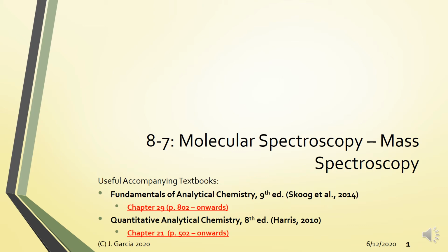So this is the last module for part 8. For this module, we will be discussing the concepts and instrumentation of molecular mass spectroscopy. Okay, now this discussion is also applicable for atomic mass spectroscopy.